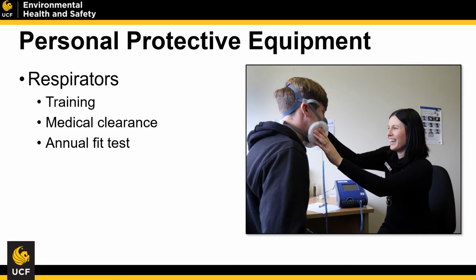Also, if respirators aren't worn correctly, they won't work correctly. So if that respirator is not seated on your face, then it's not going to get a good seal and you're not filtering out the particulate matter. That is the reason why we do annual fit testing. We want to reduce your hazard and risk.